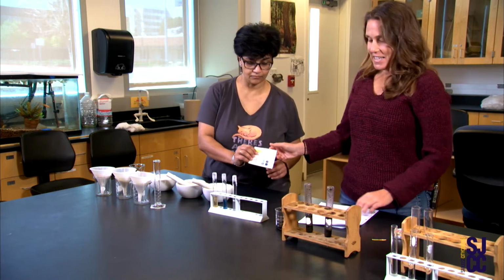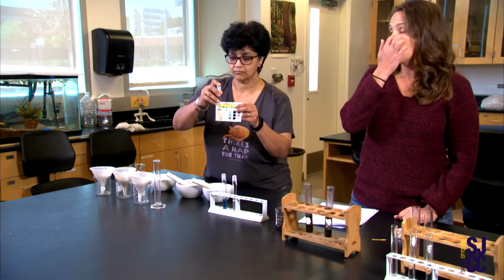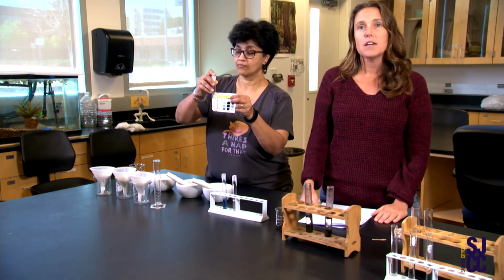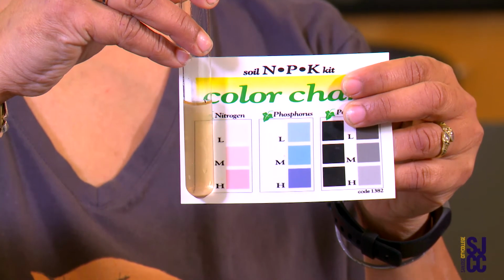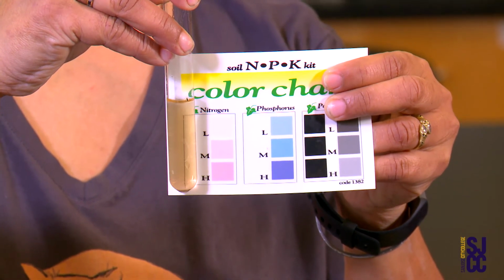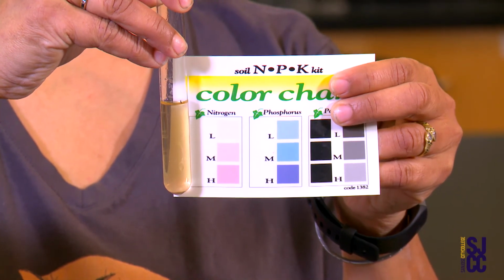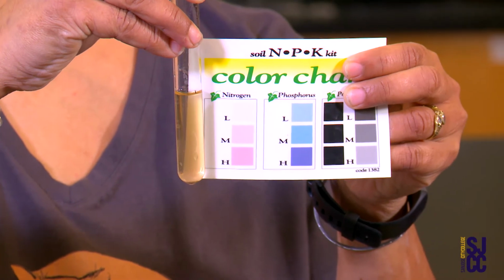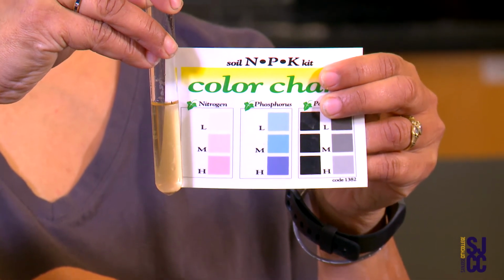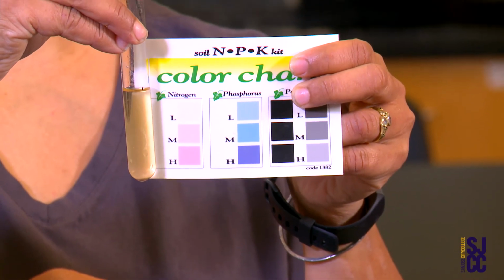So we did a test of looking at nitrogen, right? And nitrogen, we found it to be on the low to medium side, looking at the color indicator from the soil extraction. And as you can see, it's this light pinkish color. That's not necessarily good or bad. It just depends on what type of plant you're trying to grow and how you might want to amend the soil to increase the nitrogen.